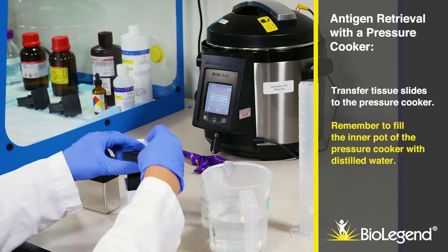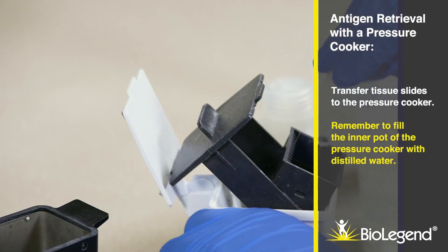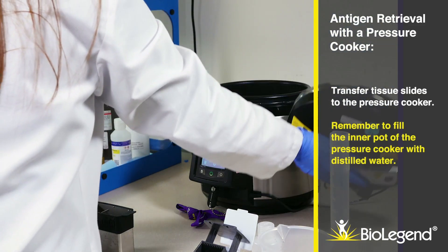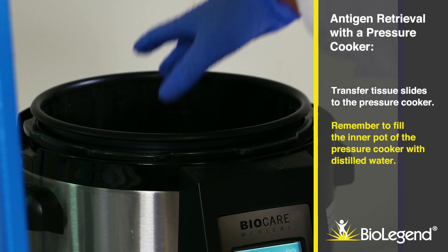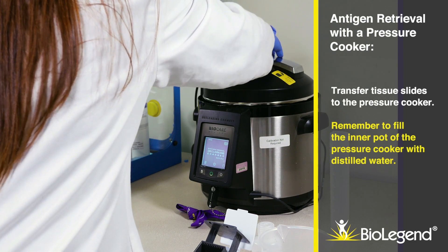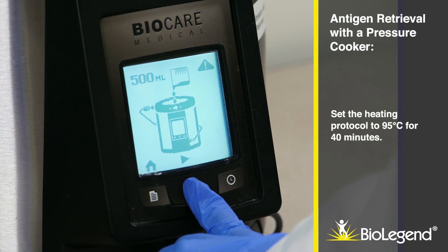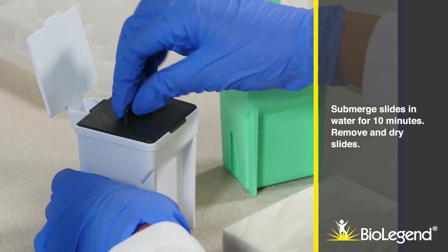Transfer tissue slides to the pressure cooker. Remember to fill the inner pot of the pressure cooker with distilled water. Set the heating protocol to 95 degrees Celsius for 40 minutes. Submerge slides in water for 10 minutes.